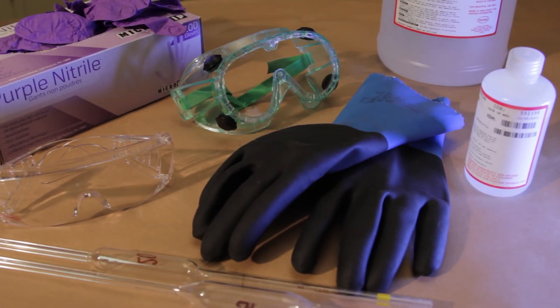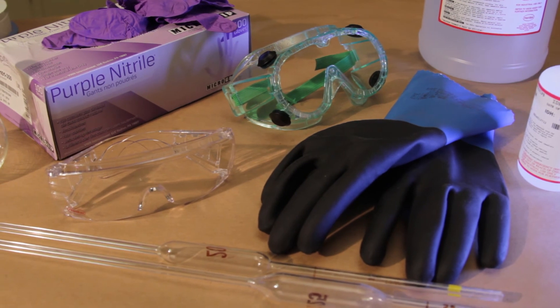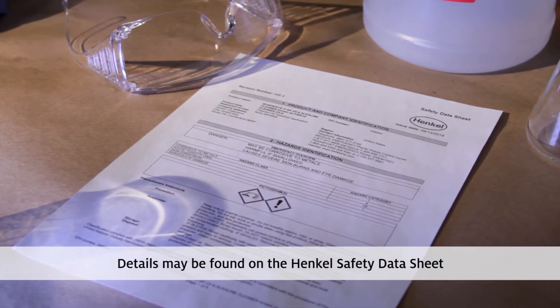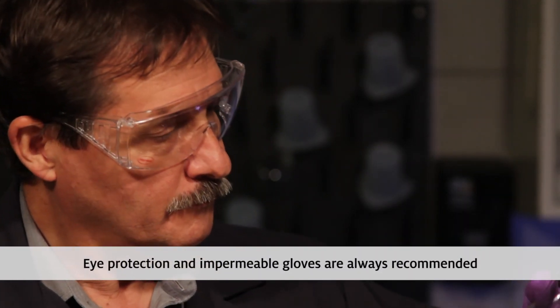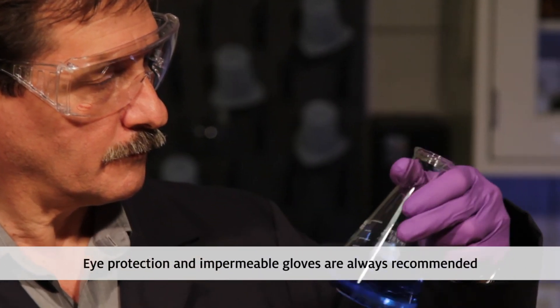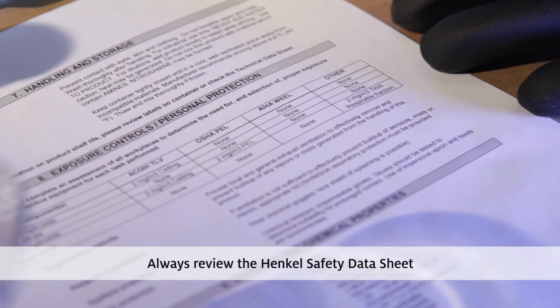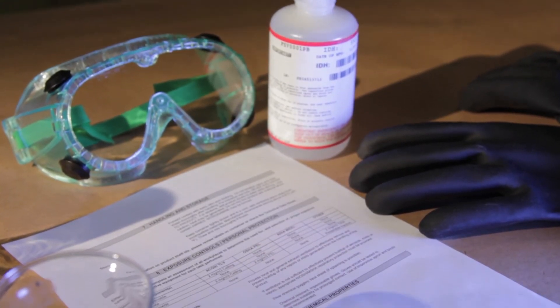It is important to wear the correct protective equipment when handling chemicals and glass test equipment. Details may be found on the safety data sheet for the Henkel product that you are using. Eye protection and impermeable gloves are always recommended to avoid exposure to chemicals. Always review the safety data sheet before using a material for the first time, so you understand any risks and what PPE may be required.